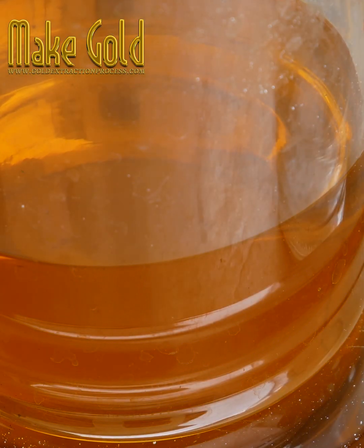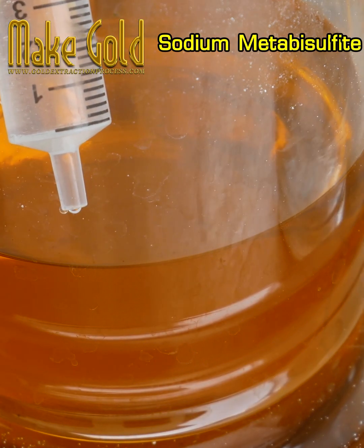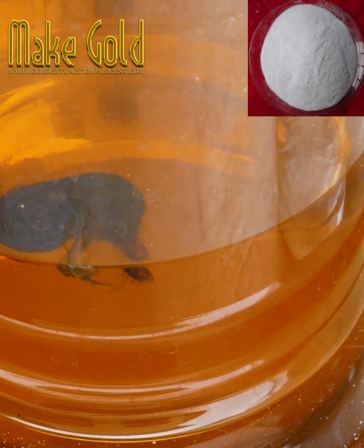Use sodium metabisulfite to precipitate gold out of the aqua regia solution. You will get a gold sludge powder that looks like mud.